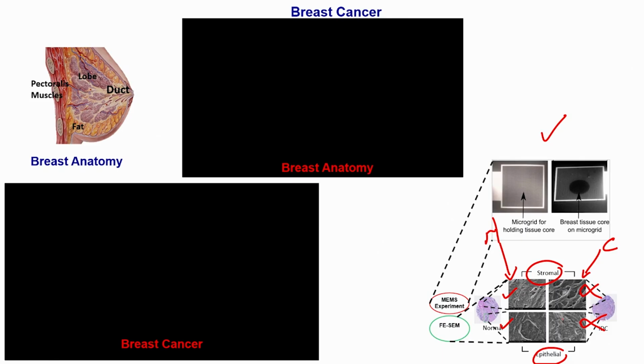These are SEM images of breast tissues, and these breast tissues are nothing but tissues that are taken out with the help of biopsy, alright.